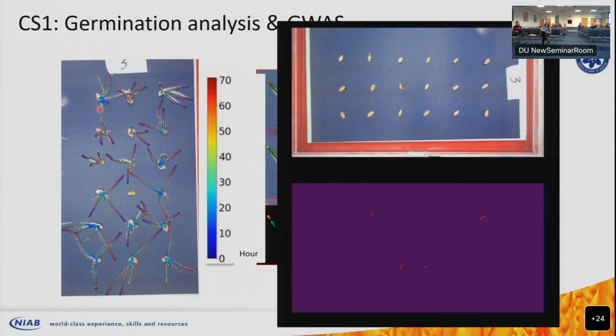And then you can see that from the same genotype, so same seeds, we're monitoring at which particular time the radical emergence happened. And then we did not follow the actual image. We built the skeleton from that. It's graph theory, basically, so that everything that we monitored based on a tip can be quantified.